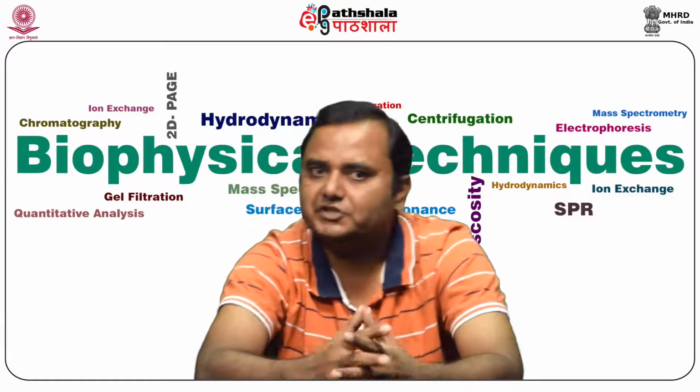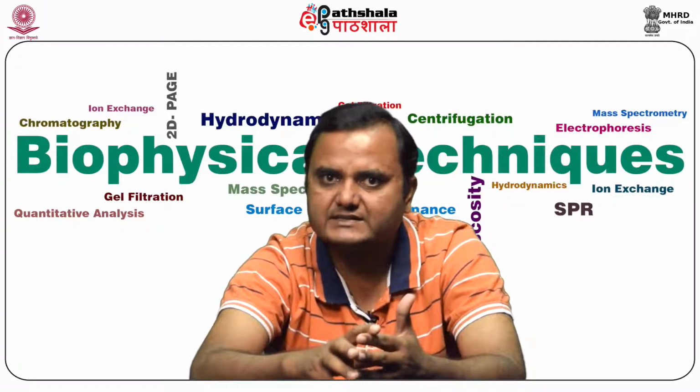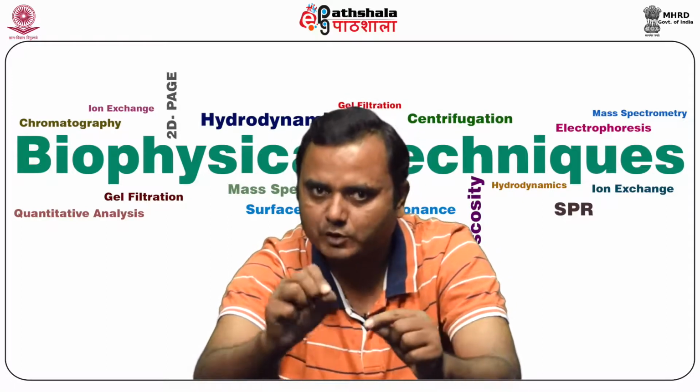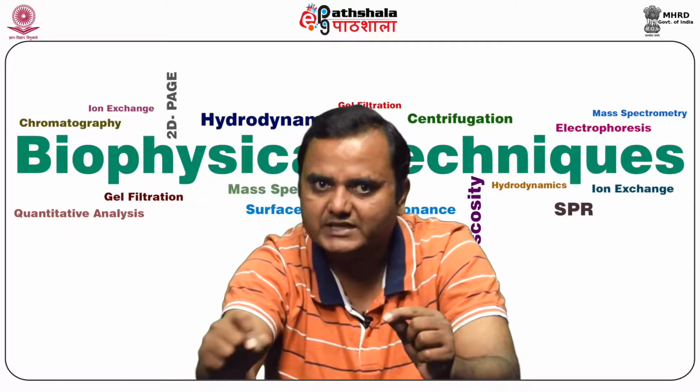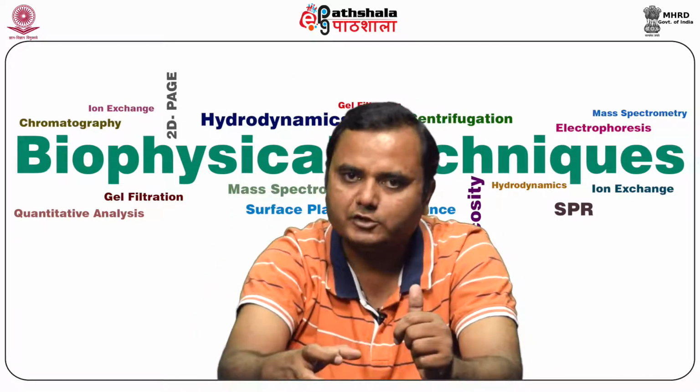Density gradient centrifugation, as the name implies, utilizes a specific medium that gradually increases in density from top to bottom in the tube. So there is a gradient in the tube, increasing from top to bottom.